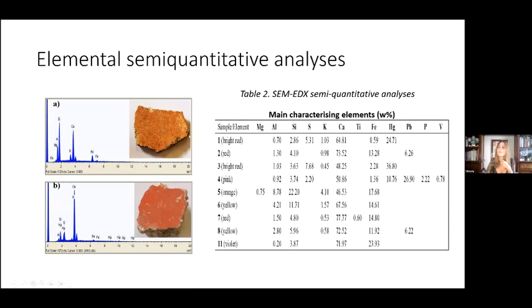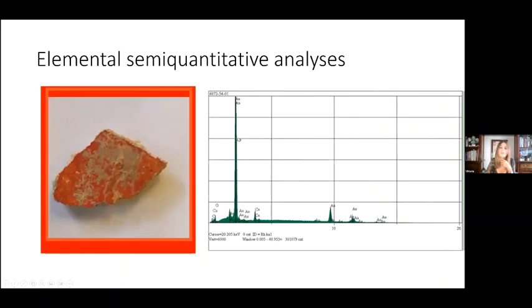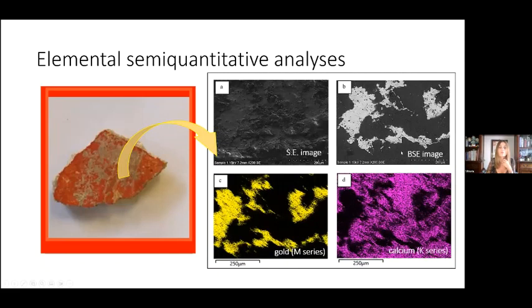in the yellow sample. Finally, I want to add that the bright red sample one also gave the unmistakable signals of gold. The last result that consisted in a revealed percentage of gold equal to 95.4% was not included in the table since it refers to a spot analysis performed on the gilded area of the sample. The distribution of gold was also determined to try to figure out a possible meaningful shape, but it wasn't the case because the area was too little.